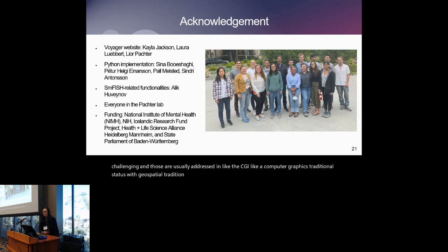I think it's probably not the most urgent right now, because the vast majority of spatial transcriptomics datasets are pretty much 2D. I think another challenge will be what we should do with the z-planes, because I do know there are some 3D datasets, like in Visium, that would take many sections along the z axis with various spacings. But in that case the resolution in the z direction would be very different from those in the x and y directions, and I think those might have implications.